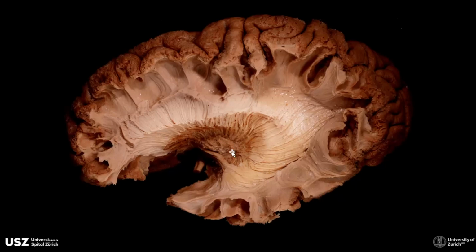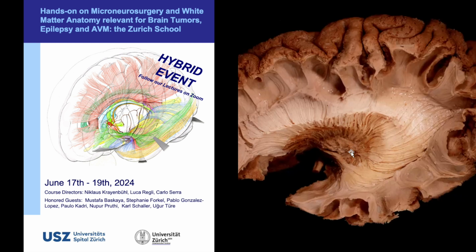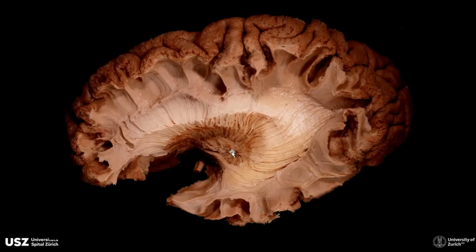Again, I repeat, it's very important. We have a lot of time. We have 3 full days of dissection. So we have to do one half day. So you have the time, particularly for the first part, the decortication. Take it gently and slowly, no hurry at all.